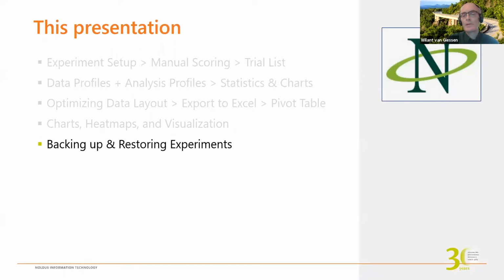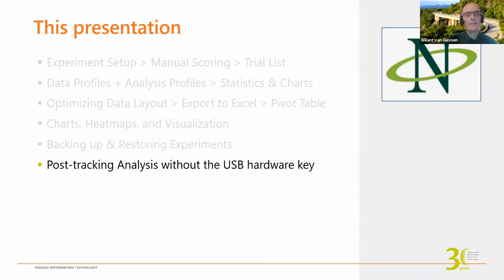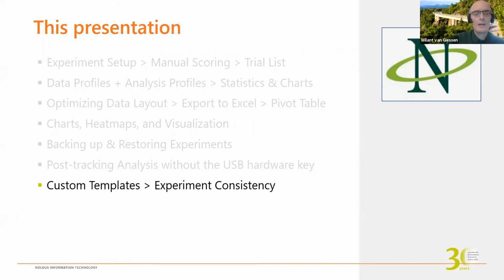And here I am really hoping I'm preaching to the choir: backing up and restoring, very important. And in fact, we need to also talk about post-tracking analysis without the need of a hardware key. That's sometimes unknown by users. Then we'll look at custom templates so you can achieve maximum experiment consistency. That sounds good.